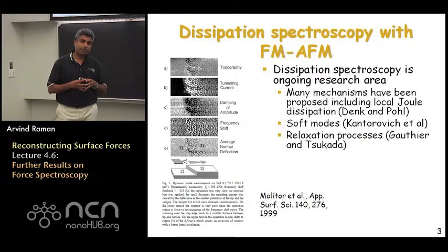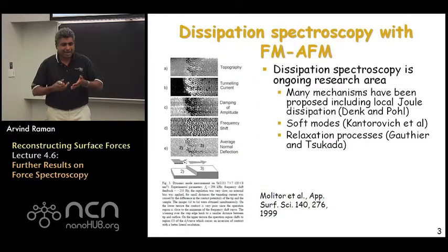This is an ongoing area of research, and in many cases, the form or the reason for the dissipation really depends on the specific tip-sample interaction combination that's being used. So one needs to know something already about the likely sources of dissipation when one looks at these images.